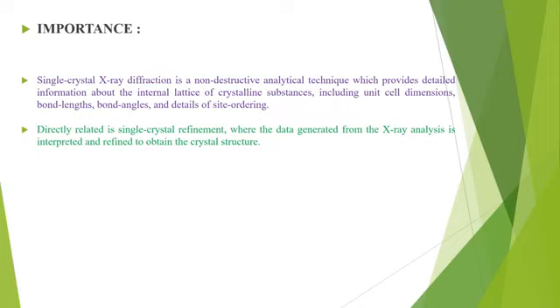That means the data generated from the X-ray analysis is directly used for single crystal refinement, and also to obtain detailed information about the crystal structure.